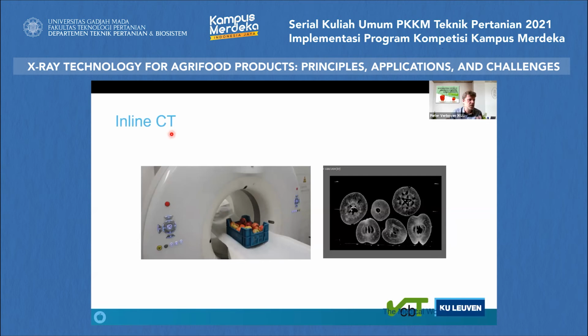Another aspect is, you need the instruments to do it in practice, this inline scanning. So inline CT is possible. I showed you in the beginning the hospital scanner. This is the ideal scanner, of course, for inline assessment. It's a very fast instrument. Within seconds, you can measure.